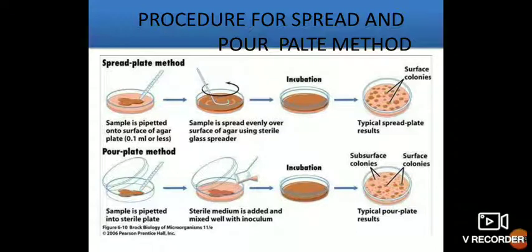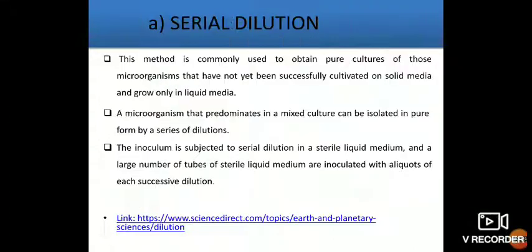And in the pour plate, both the media and the culture are mixed together, and you can pour it on the plate, so that you can see the colonies in the plate after the incubation. That's what is mentioned here.